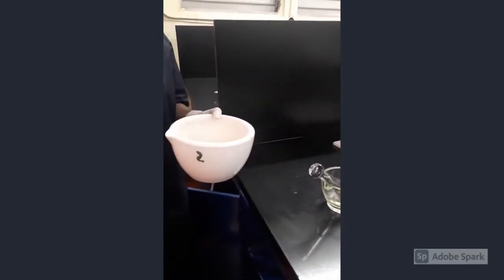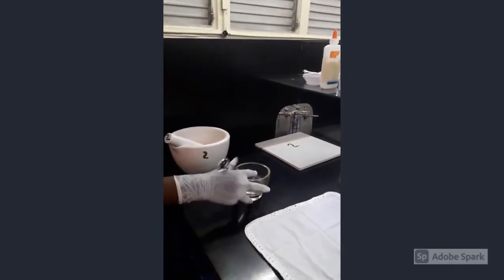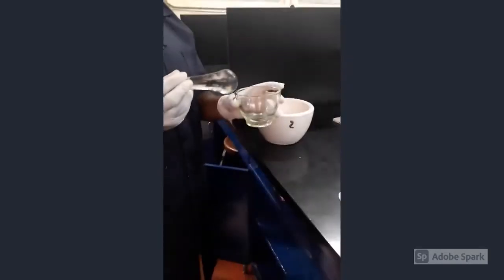That will be our porcelain mortar and pestle, and our glass mortar and pestle.